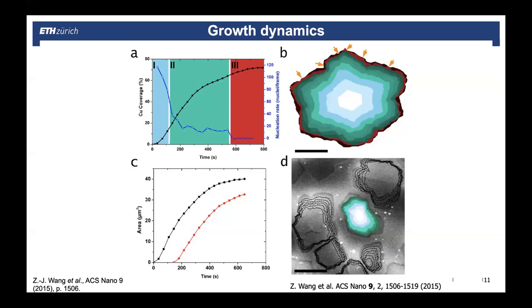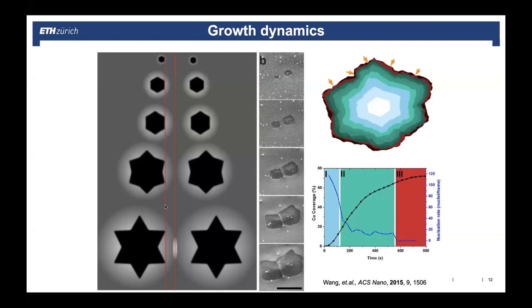So you see here, this is just a simple hand-drawn model. You have these nucleation events and they start to grow. There are some growth species made by the copper because it's catalytically active and helps to dissociate the hydrocarbon. And then these nuclei are feeding. So there's a growth front in which there's a kind of depletion layer because carbon species get attached to the growing graphene island. And then growth is nice. It's basically attachment limited. Carbon just gets built into the structure, it grows. The radial speed is constant. And when the radial speed is constant, then the area is a square function, right? That's this region where the area grows as a square function, because the radius goes linear, and then the area goes square, pi r squared. So you have the square function.